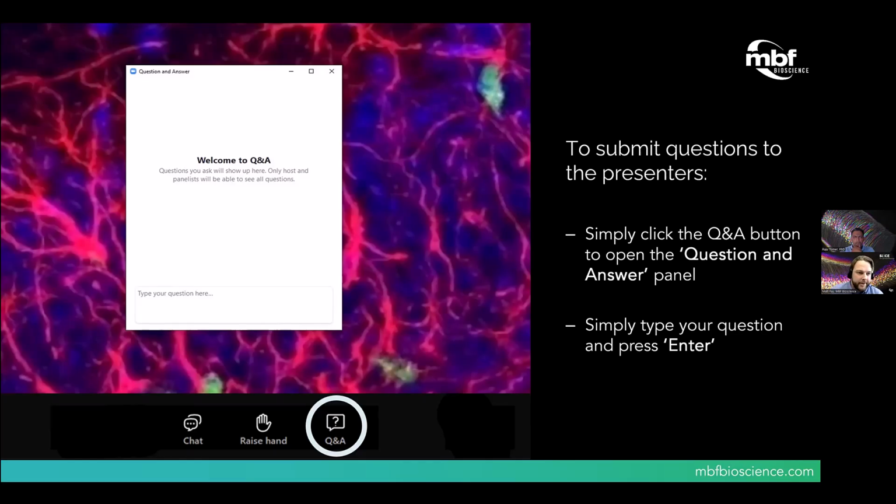See another question here about how fast this microscope can acquire or scan a mouse brain in 2 channels. Typically at 10x, it takes about 4 to 6 hours to acquire each channel. So you're looking at something around the range of 8 to 10 hours, 12 hours, depending on the size of the sample.